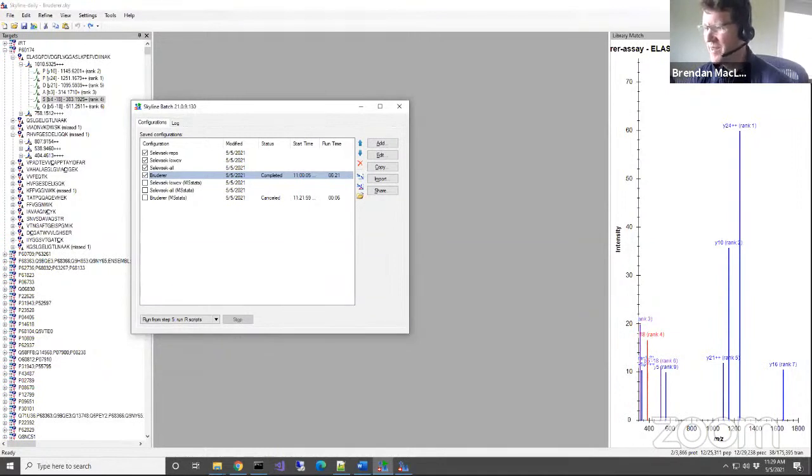That might be cool as a next step. I definitely have things that I consider more important, but at some point maybe we'll say, yep, okay, there's a job queue now, and you've just added things to it. And now, if they haven't been run yet, you can change the order.